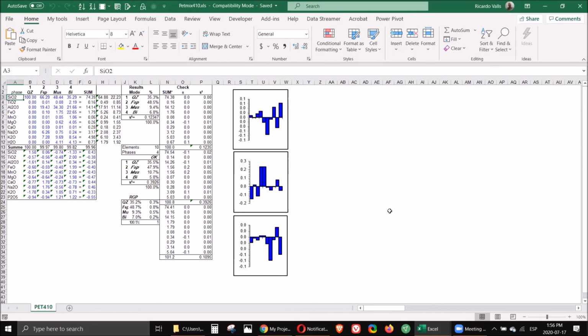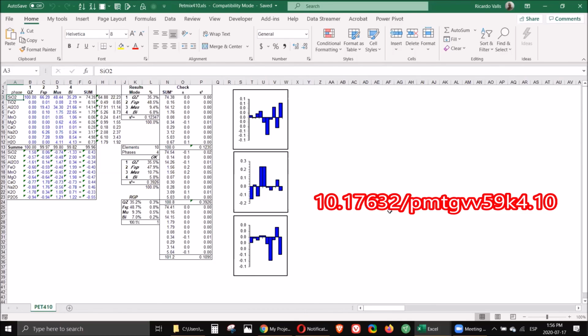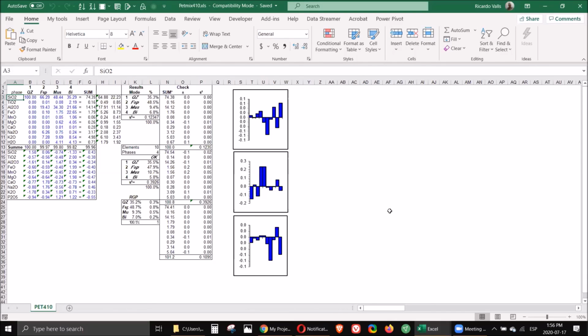All this software you will find on Mendeley, and I'm putting here a link, together with all the support materials, the data that we use for these examples, and the user guides or manuals for many of these software.